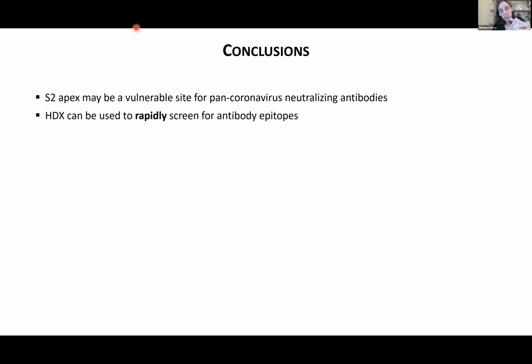Now, in terms of discontinuous epitopes, I think as long as you have coverage across your protein, you shouldn't have any difficulty identifying them. Maybe just a little bit more challenging to interpret in the absence of structural data, right? Here we had the spike protein structure, so it was very easy to map it on. I think, did I get all components of your question?